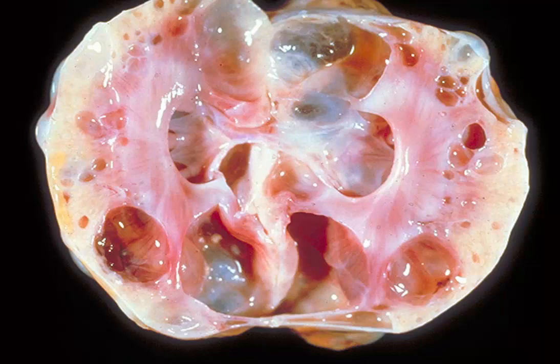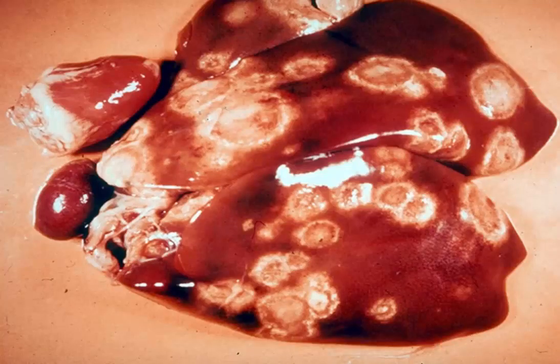Okay, finally, slide number 10. Hey, let's start the weekend off on a great note, give you sort of an easier one. Hopefully you will get this as a great, great old picture from the 1950s, taken at the AFIP. This is tissue from a turkey. Can you give me a morphologic diagnosis, a cause, and another affected organ?